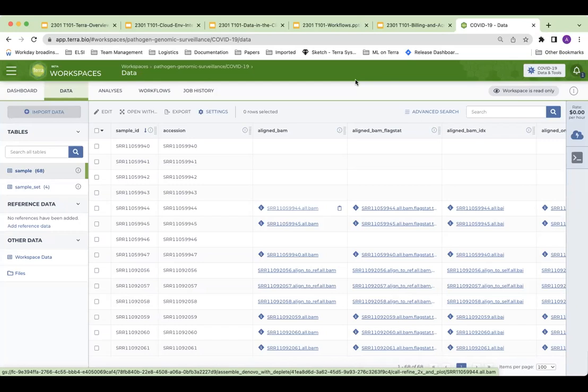So that's just like a ln -s in Bash. I'm sorry? Is that like a ln -s in Linux? Just copy a link of the file. Essentially. I think so, if I understand what you're saying correctly. Okay, yeah. Okay, so by using tables, you can keep track of all the data related to the sample in one place.